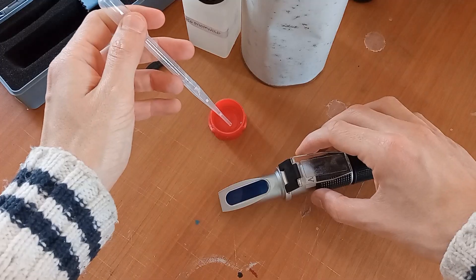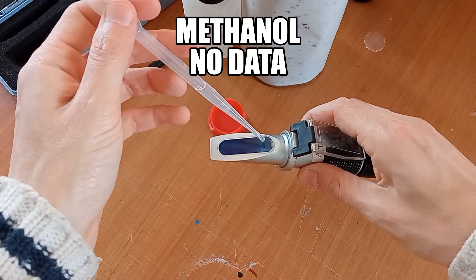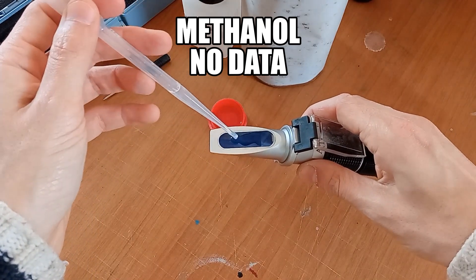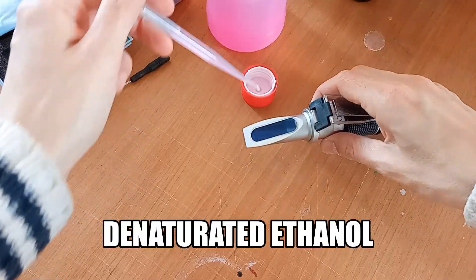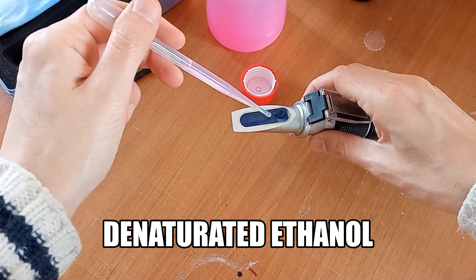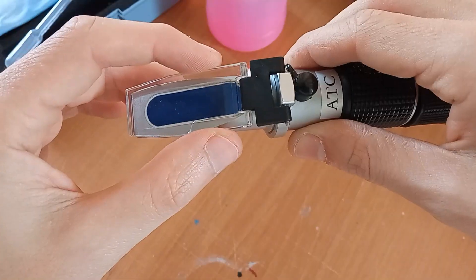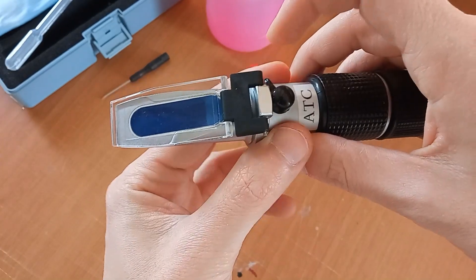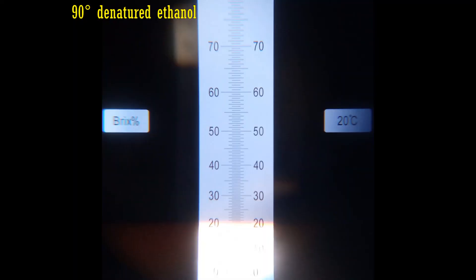Let's start with sample, methanol first. Unfortunately, methanol is less than zero BRIX, not shown. Next is 90 degree denaturated ethanol. Refractive index is 20 BRIX.